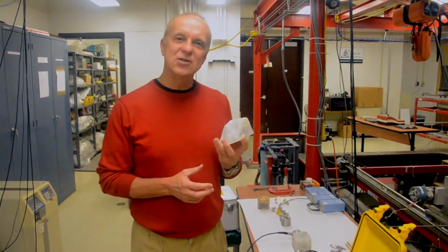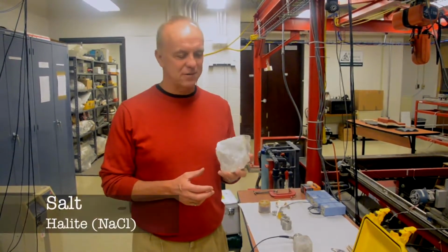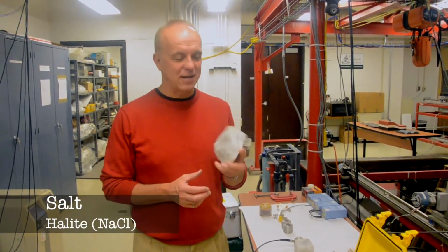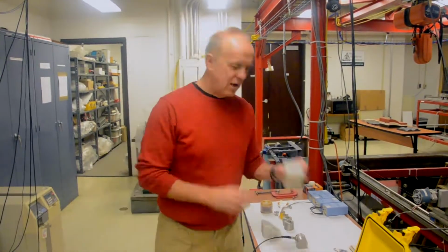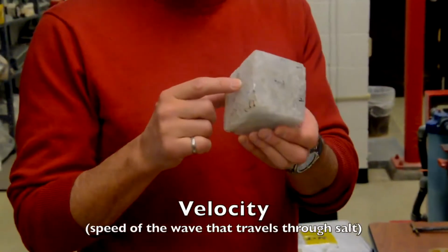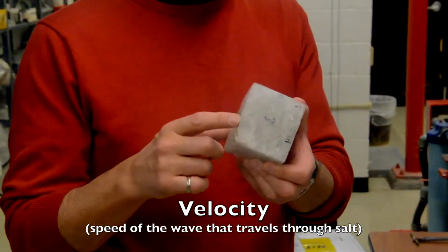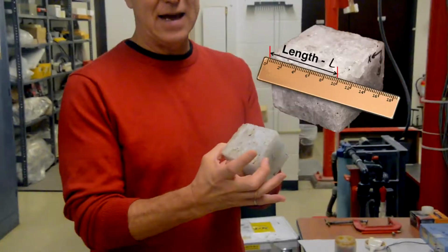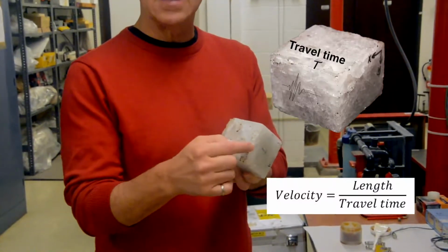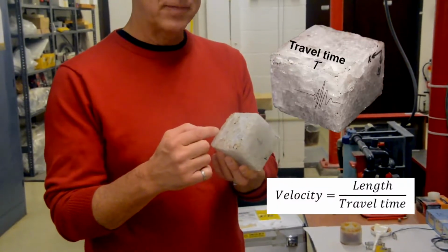We're going to be looking at salt and some measurements on salt. We have an example of rock salt here, halite, NaCl. Basically, here we've shaped a block of rock salt, so we want to find the speed or the velocity of this sample. To do that, of course, we need the length measurement, distance, and the travel time or transit time through the rock sample.